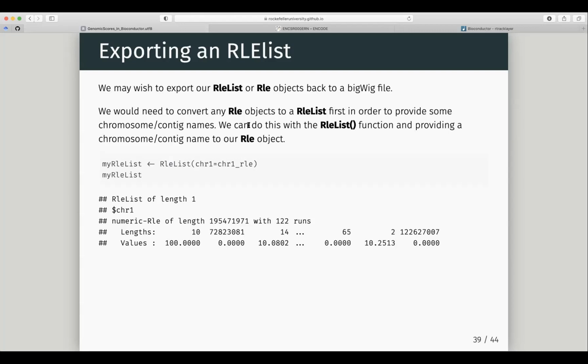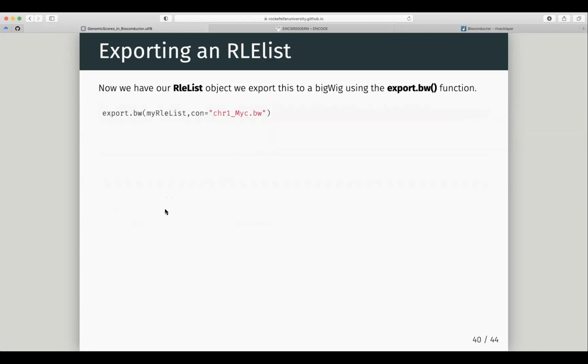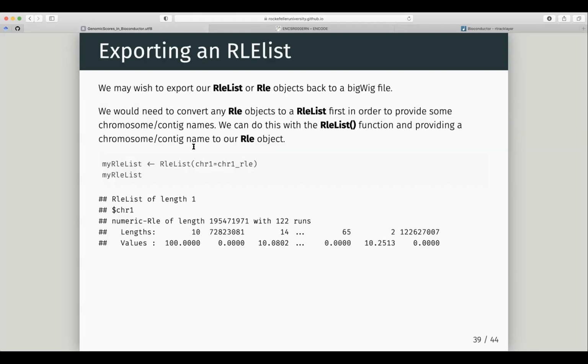Okay, so we're going to be a little early for this session. And again, if you have Windows, you are going to struggle to export because Windows wasn't supported by UCSC. So when they wrote the tools in bigwig format, they didn't really think about Windows. There are solutions to this, but for these next parts, you're going to be frustrated if you're on Windows.